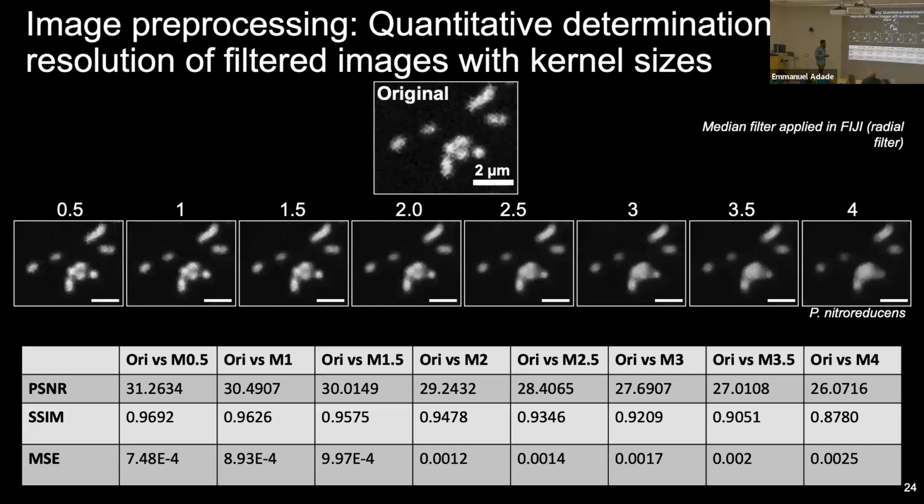So we had to think about dealing with noise in the image, right? And being able to minimize the noise to improve our training inputs, because garbage in, garbage out. So we thought about reprocessing the image in such a way that we would reduce the noise but not compromise on spatial resolution. Because if you can't tell that this is 5 cells apart as one cell, then you're losing information, you're losing data. So we wanted to still be able to reduce the noise in our image, but also be able to preserve the spatial information that existed within each image, because we really wanted to start finding specific micro-interactions. So at the little scale, we are interested in those changes and being able to tell them apart.